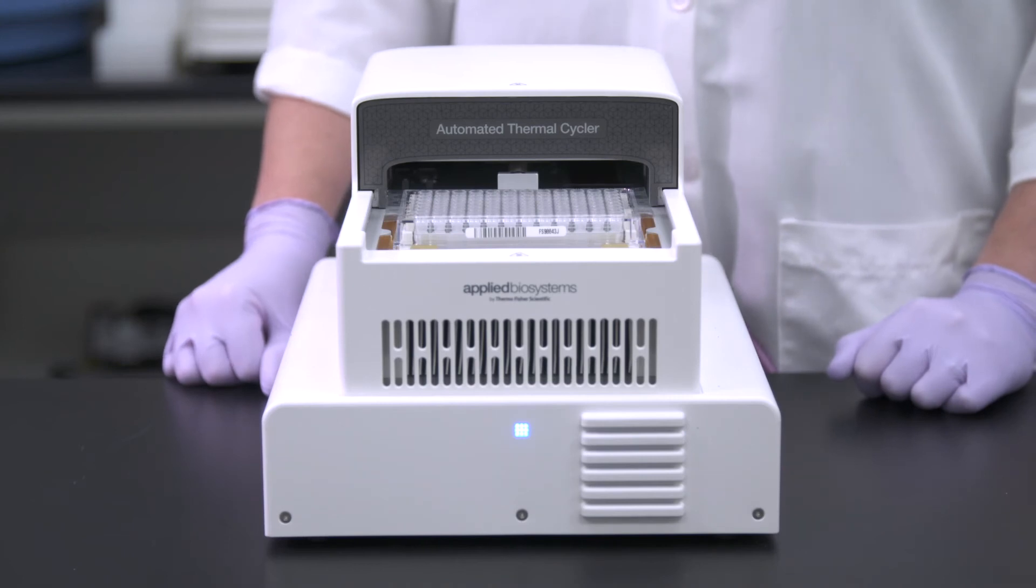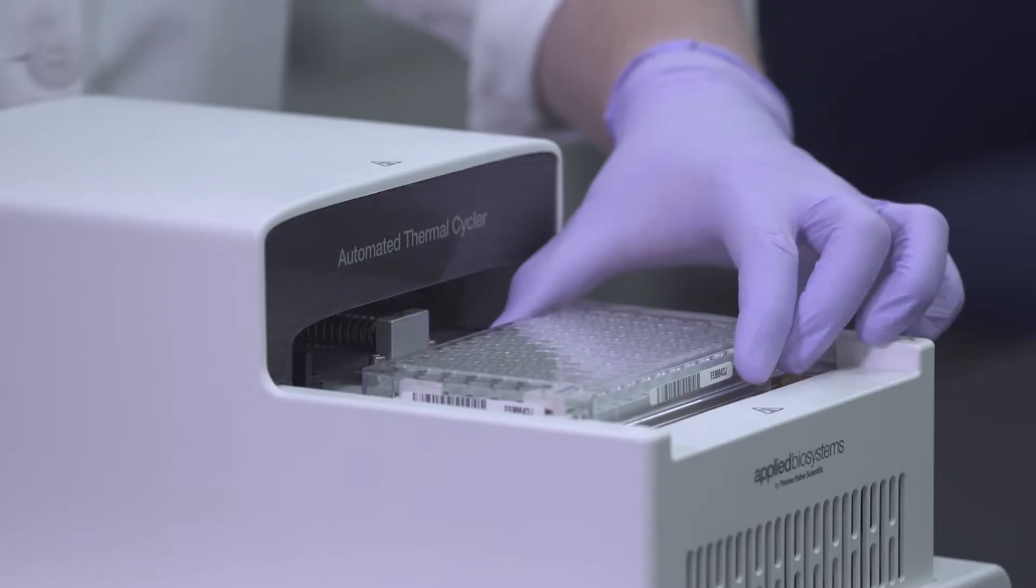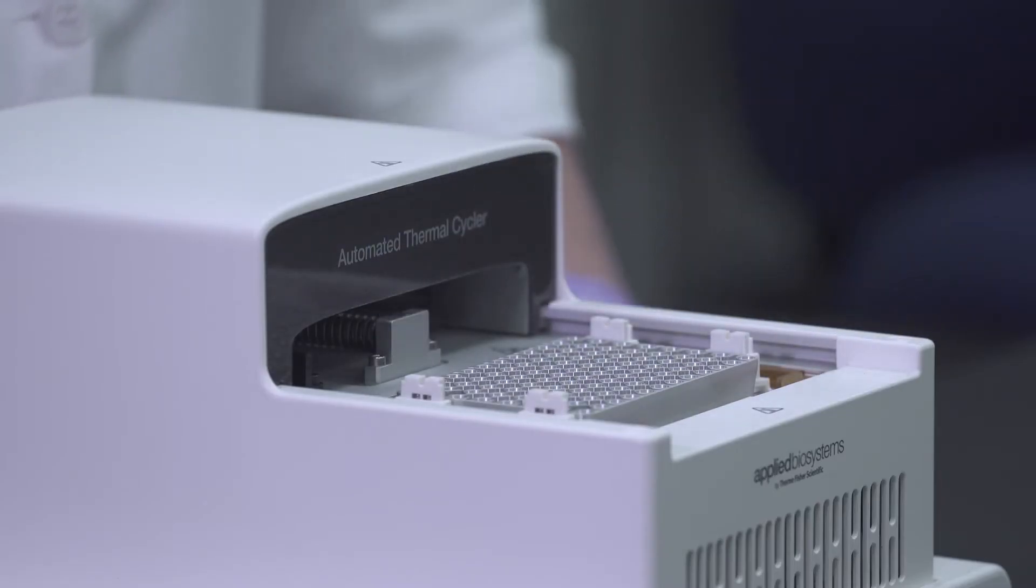The physical properties of polycarbonate also enable the plate to tolerate the fluctuating heating and cooling from thermal cycling that causes warping of standard polypropylene PCR plates.